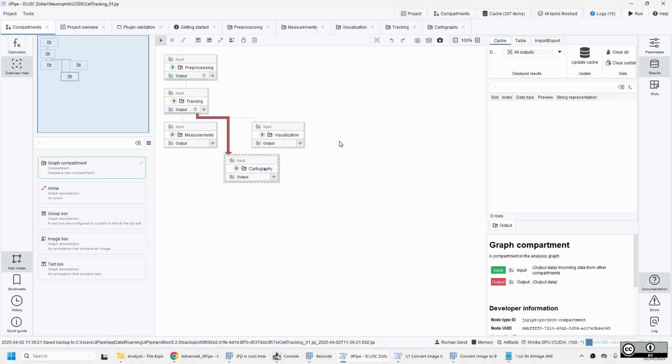And that was one of the main reasons that we developed JIPipe, to put all these complex image analysis and data handling steps into a graphical interface that can be much more easily taught and much more easily shared. Because now if I give this to you, you went through it, nobody complained. So this actually worked quite easily. And this I put together last night because I had a much more complex version of it. The point is that within half a day or so, you guys all have it and know how to use it, and you can take it from here and develop it further.